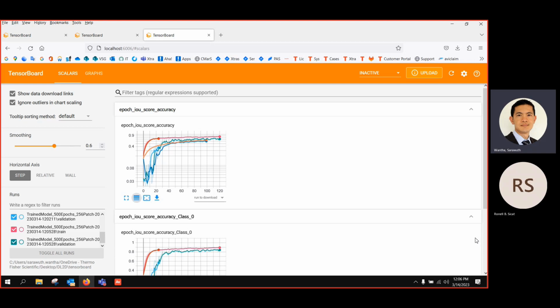But most of the deep learning training runs on the RAM memory, so you also need a high amount of RAM, like 128 gigabytes. So it really depends on the RAM.